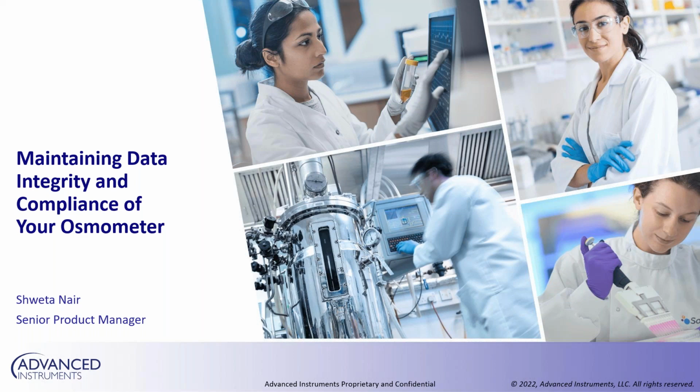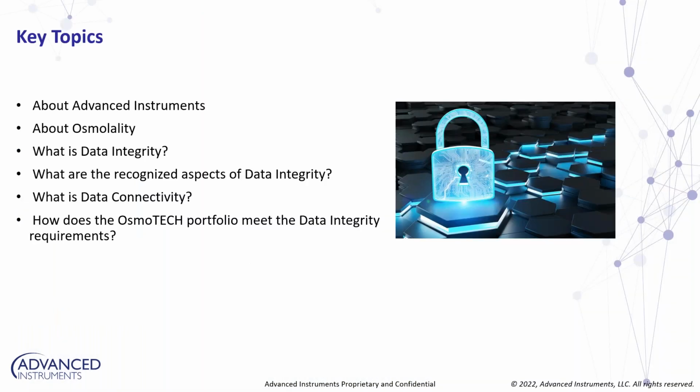So as we get started, I'm just going to go over quickly the agenda. I'll introduce a bit about the Advanced Instruments company. We'll discuss what osmolality is, what the value of osmolality is, and then really go into data integrity. What does data integrity mean? What are the recognized aspects of data integrity that we need to address when we speak about maintaining data integrity?